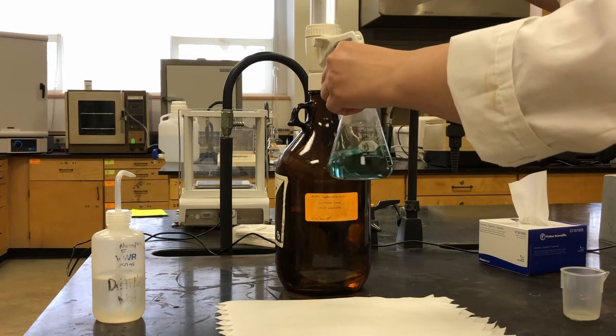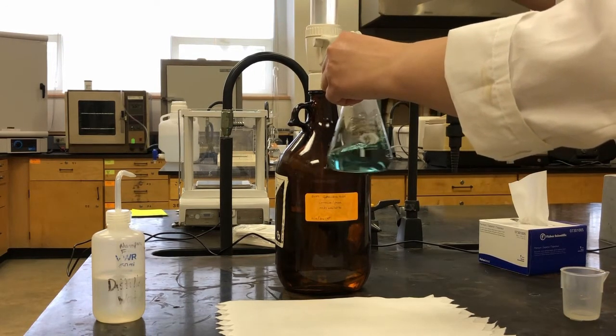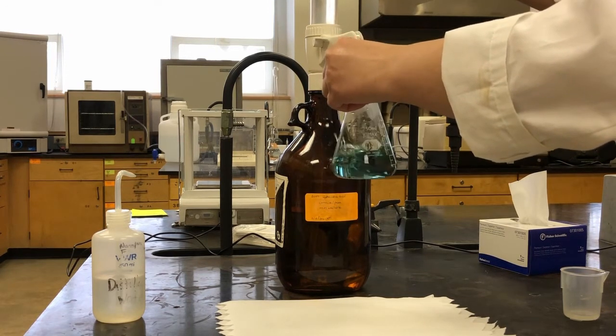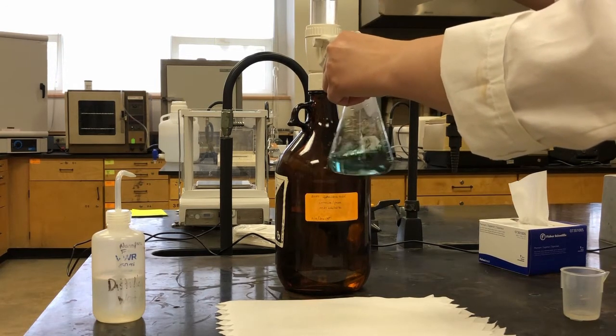So I'm just adding hydrochloric acid very slowly at first, and we're looking for a color change from the green color to the original red color of the boric acid with the indicator.